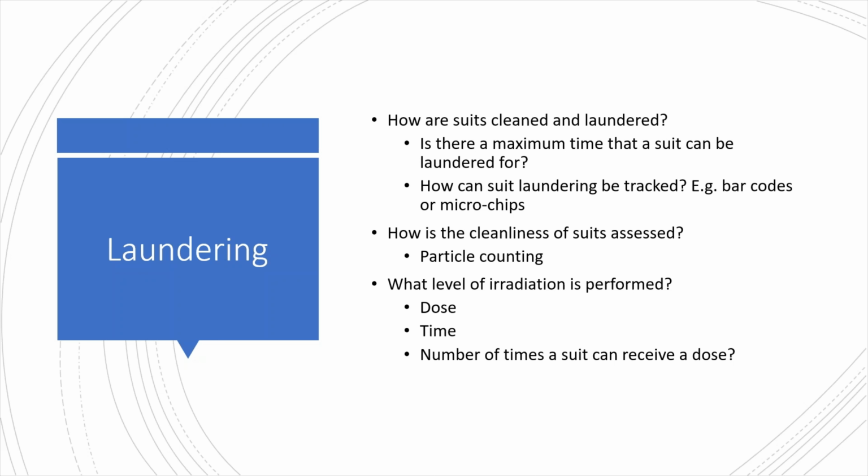We also need to understand how cleanliness is assessed and whether the manufacturer is undertaking the appropriate particle drum test to assess this. And if the gown is subject to steam sterilisation or irradiation, then the steam cycle must be understood.